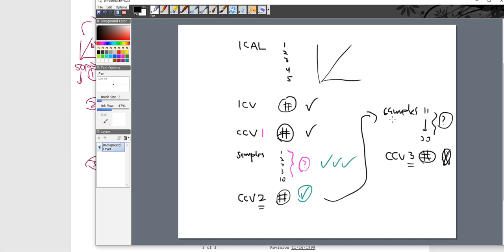So what this means is that everything in this section now, can't report it. That's the purpose of a quality batch, folks. These are the hurdles that we have to make it through, because all of these checks are in place to make sure my instrument and my procedure is going according to plan. And if I cannot introduce quality checks, then I cannot trust the data that the machine and the procedure is basically providing me on a fancy looking report.